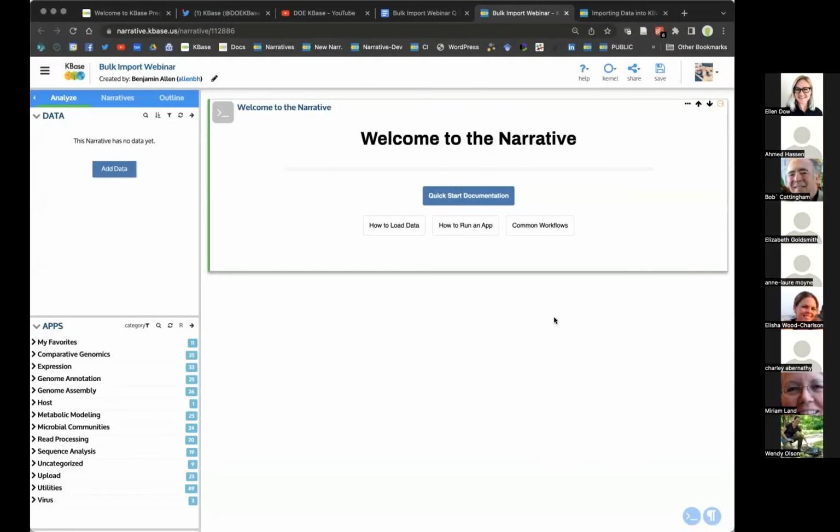All right, thank you. So hopefully everyone is familiar with narratives. If you've used KBase, you certainly know what a narrative is, and you know that this is where we really want to start importing our data to do any analysis on it. So what I'm going to show really quickly before I jump into the demo of bulk import is some of the old ways that we would import data.